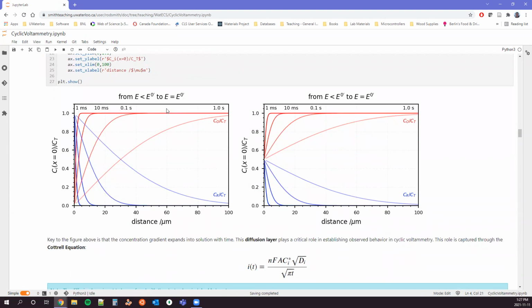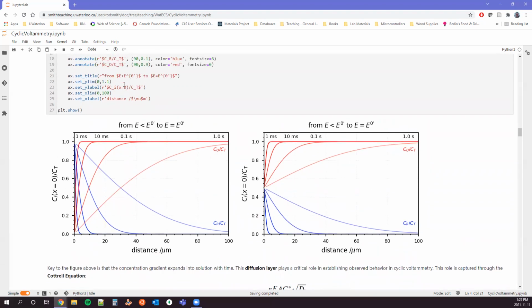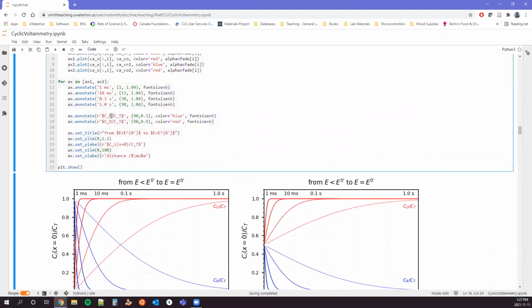I might have my values reversed here. Yes, I do. We're starting from E well below our formal potential, so we should have 100% reduced. These values are incorrect. These should be O and R.